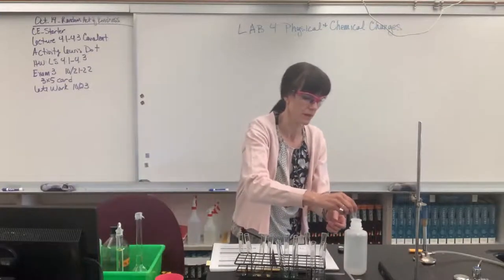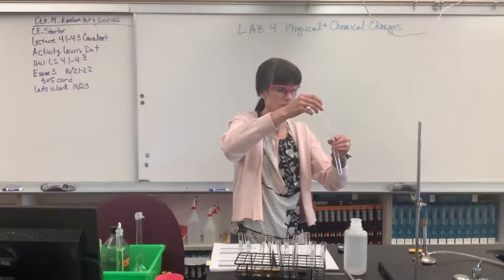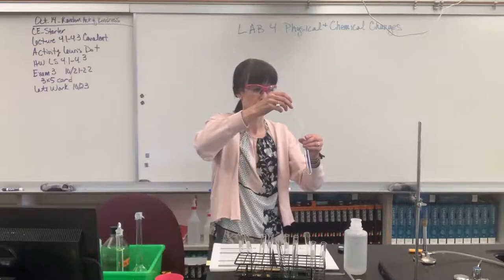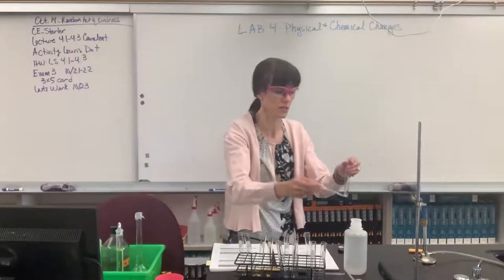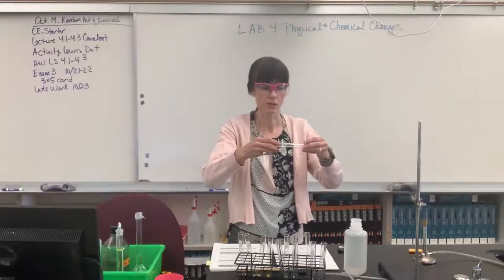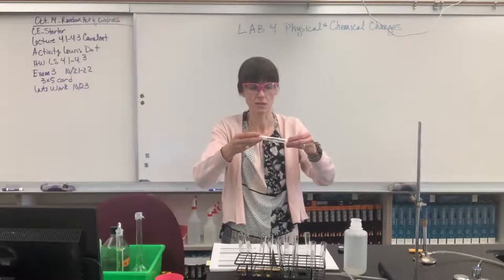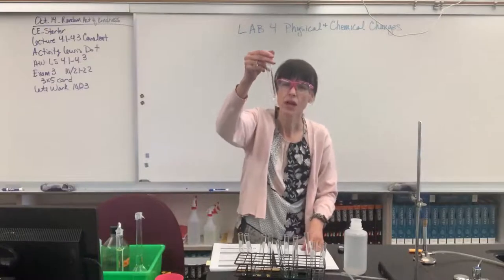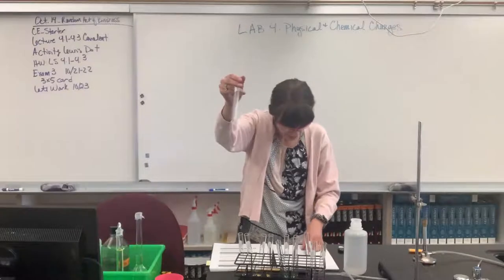Okay, so we put in 1, 2, 3, 4, 5, 6, 7, 8, 9, 10, 11, 12, 13, 14, 15, 16, 17, 18, 19, 20. Great. Okay, I'm supposed to shake this around, let it all dissolve. I had a little bit on the edges of the test tube. Okay, so shaking. And it's getting clear as I'm shaking it. I'll keep shaking that for you.